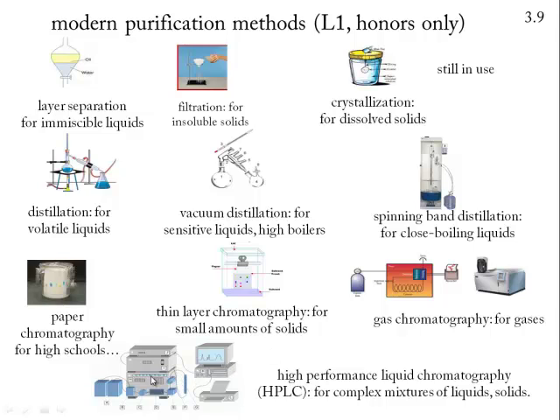As it comes out, it typically drips out of the back of this thing, and you can collect it in a vial. And this is known as HPLC, or High Performance Liquid Chromatography. Of all the methods, it's probably the most generally useful here. These are a bunch of different purification methods. Note that none of these methods identifies what the heck it is. You might get a peak, but it doesn't tell you what it is. In our next screencast, we'll look at identification methods. This is Screencast 3.9.